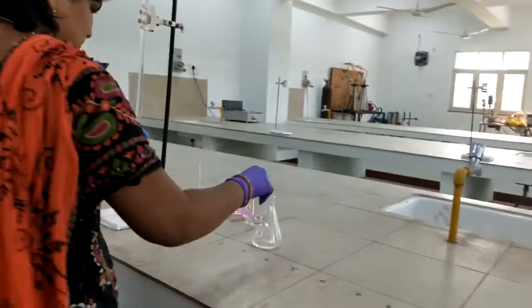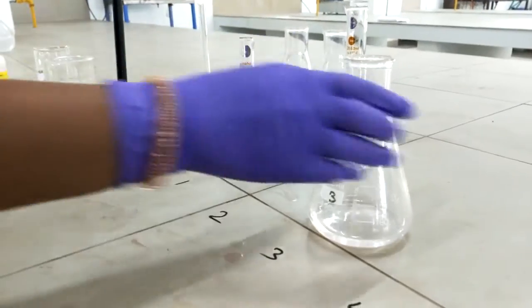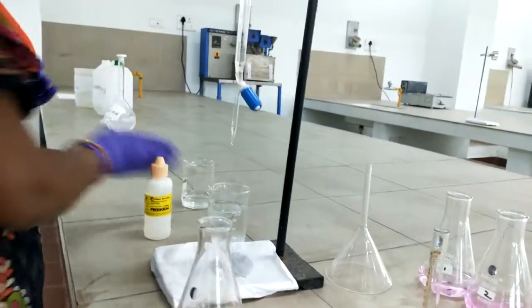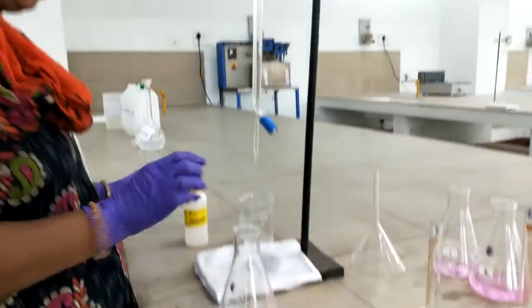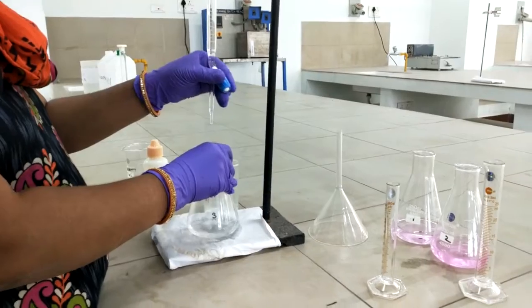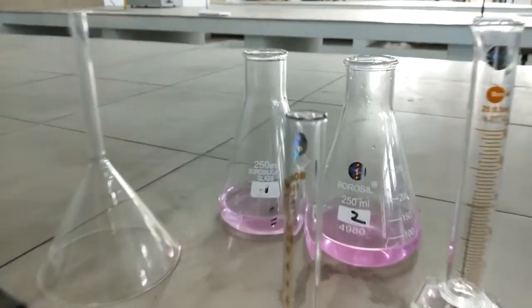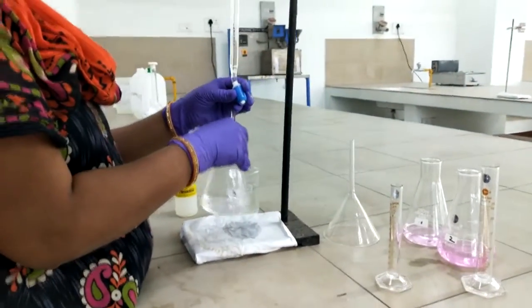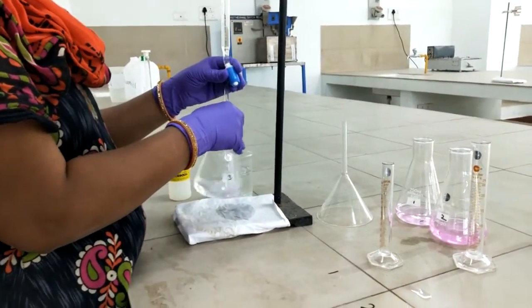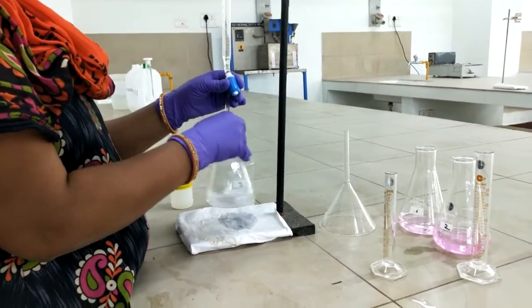Add 10 ml of sample to 20 ml of HCl and 2 drops of phenolphthalein indicator. Titrate it against 0.05 normal NaOH solution. Okay, so we have filled it to the 0 level. Start the titration. So you can see the difference. This time we got the perfect endpoint. That's what with practice we'll be able to get the exact endpoint.